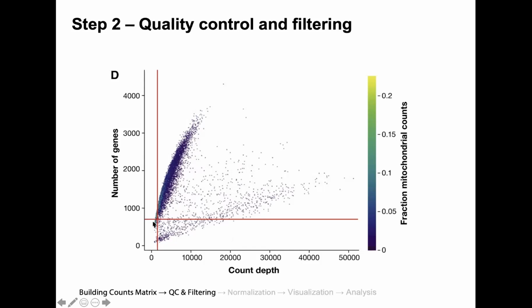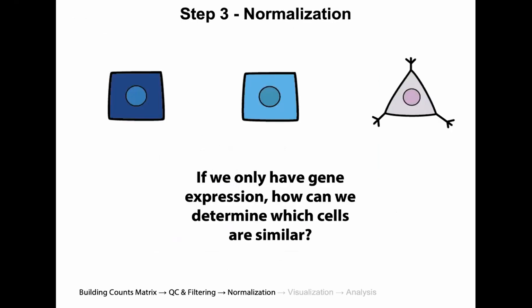And then you might also take this plot and look at the number of mitochondrial counts in the data set, and look at the fraction of RNA mapping to the mitochondrial genome. As I said before, this is much more of an art than a science. I know that I haven't gone into too much detail here because we're limited a little bit on time, but I want you to know that you can consult that manuscript. There are a bunch of other papers on low-level pre-processing that I encourage you to consult, and we're actually going to play around with some of these thresholds later today in the notebooks. We'll hopefully give you a little more of a sense for it.